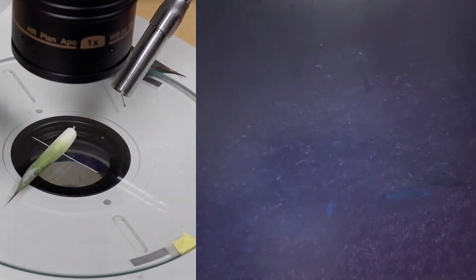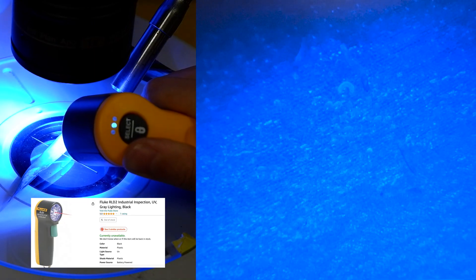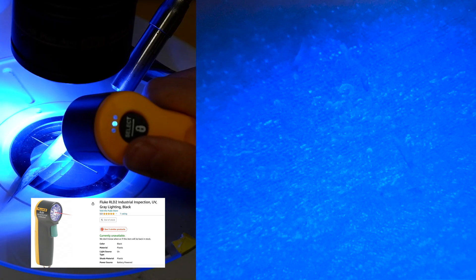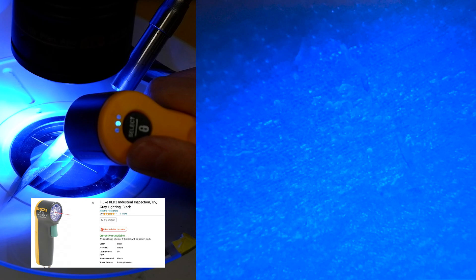Let's try the other eggs. This shows it really well. And it's finely adjusted. You can see stuff, but it's not easy. You can see they're basically all over. This is the exact same angle. I haven't moved it at all. So you can see some of the mites moving and you can see some of the eggs, but there's not good contrast. Everything is just like a different shade of blue.